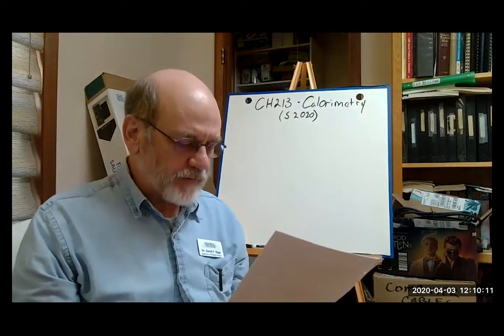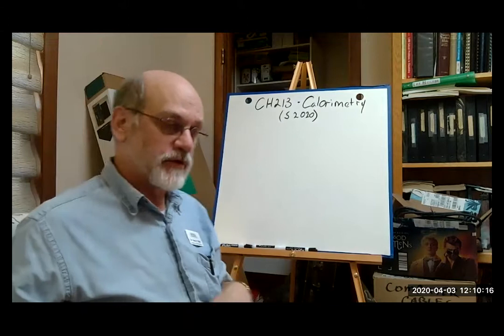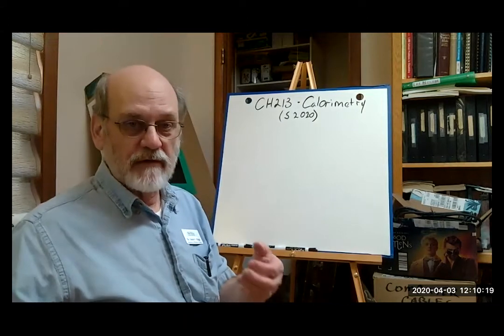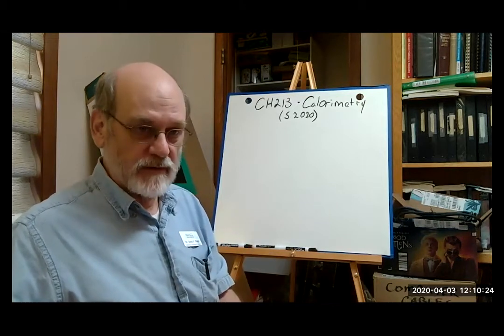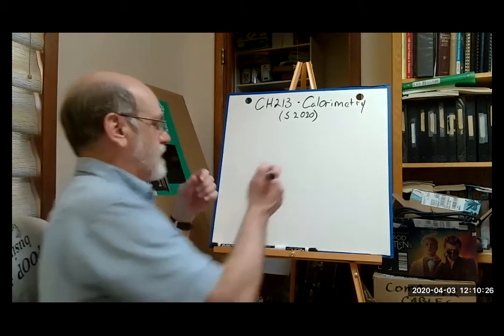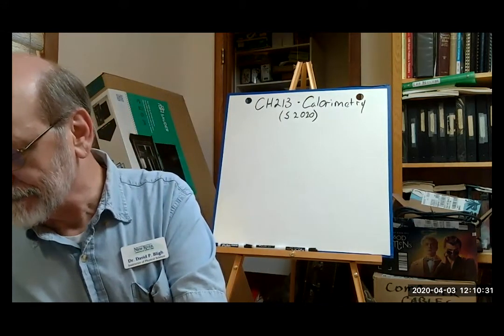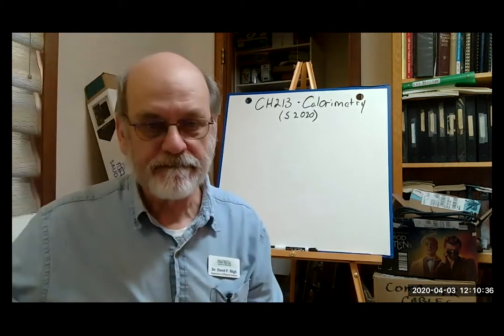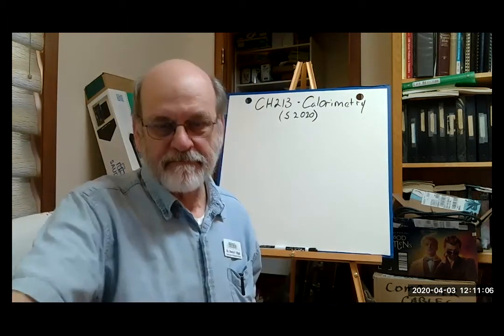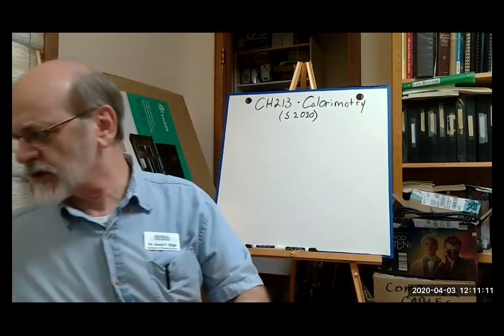And in order to do that, we're going to take 75 grams, which is equal to 75 milliliters of hot water, and 75 milliliters of room temperature water, and let me pause for a second. Okay, I'm back.